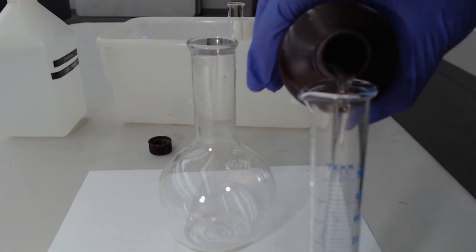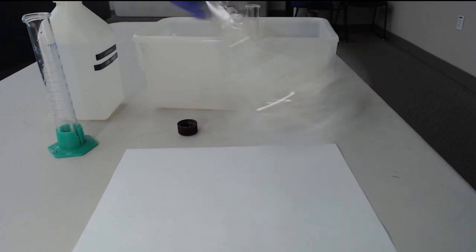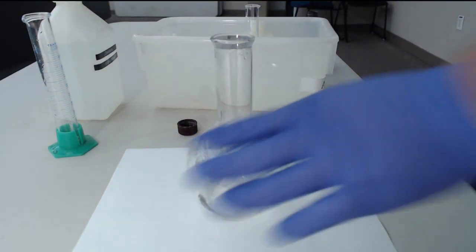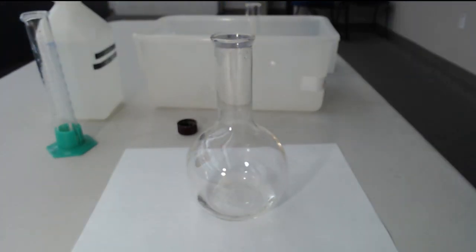Not so much anymore because, all right, so I'm just swishing it around. This is a Florence flask. Typically we use these for mixing and not for cooking.